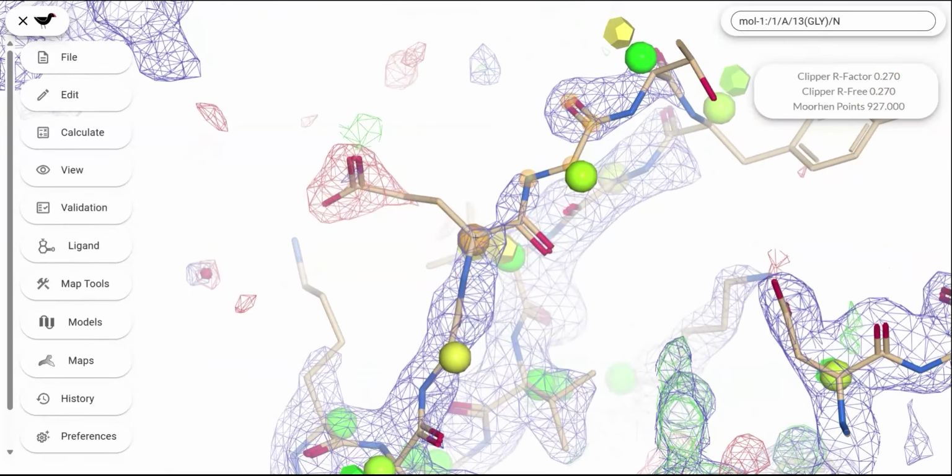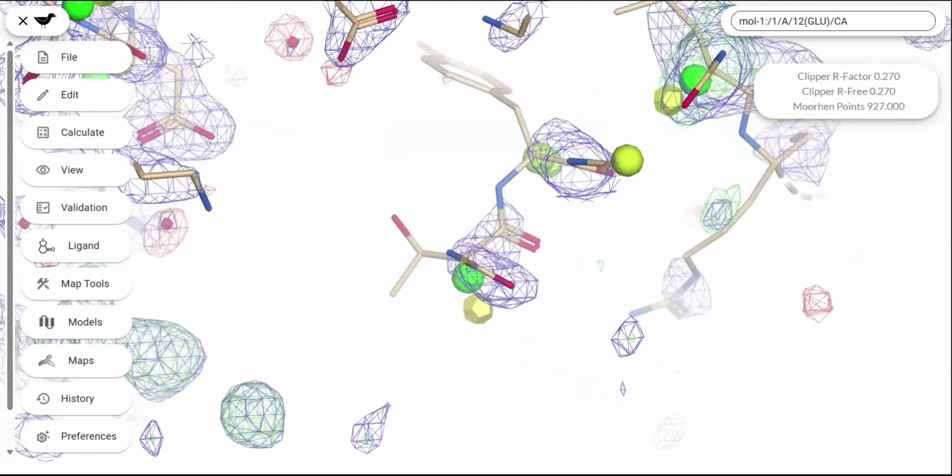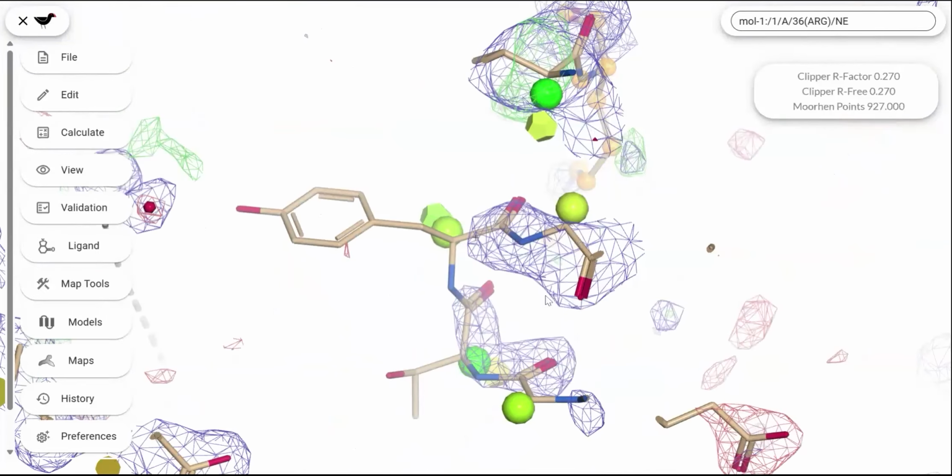In the real world, if you really wanted to dig deep into this and figure out exactly which amino acids are supposed to be there, you can do so by obtaining the sequence and double checking. Say, okay, this is residue number 12. Does the sequence say residue number 12 is a glutamic acid? If it says yes, then we definitely have to keep it that way. If it says no, then you can go ahead and fix it to the actual residue identity. That will be something that we'll do for our projects.